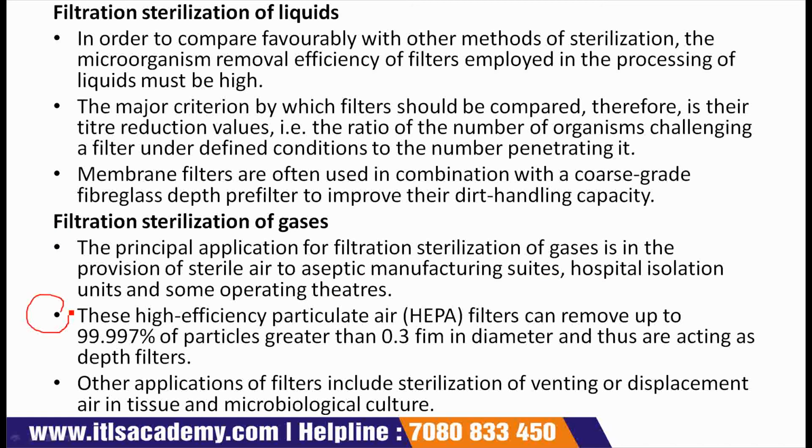Next point. In our previous point, filters consist of microfibers. So we are going to our next point, and this is that these high efficiency particulate air HEPA filters, as these contain microfibers, are known as HEPA filters, that is high efficiency particulate air filters.